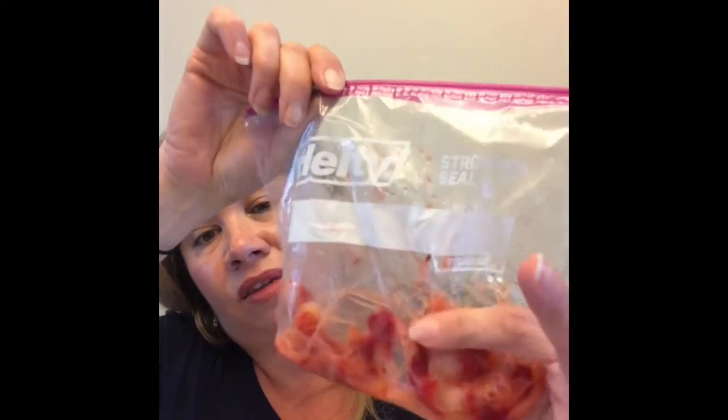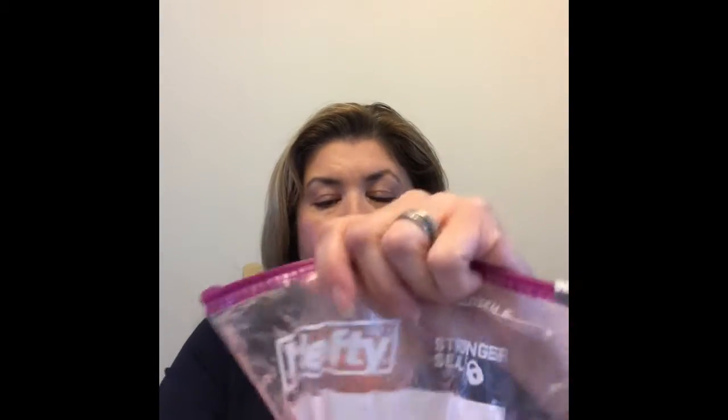Once it's all mushed up and it starts to look a little like strawberry jam, you want to add a little of your soapy water. A splash or two is fine. And again, mix, mix, mix, and smush so it's nice and juicy.